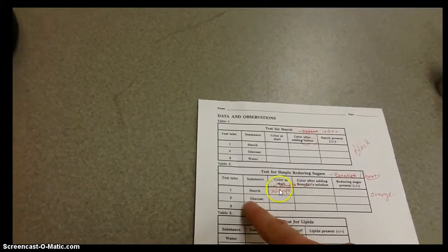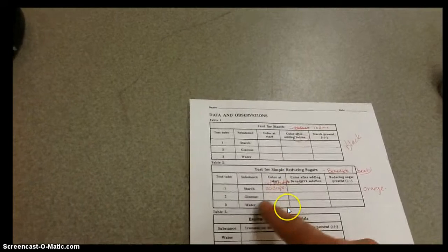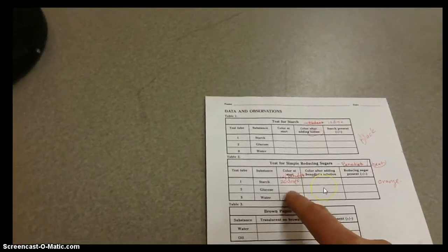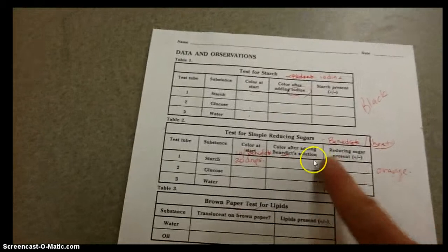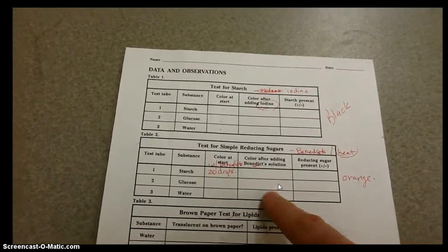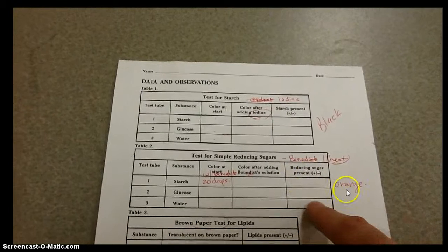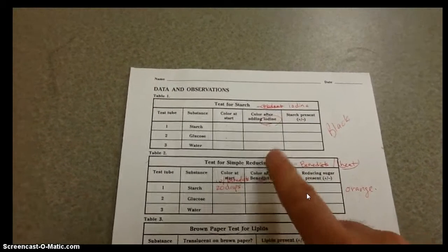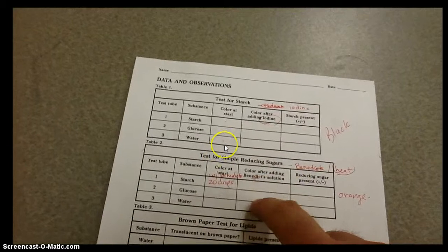Okay? After adding the Benedict solution, what color is it? Then after we heat it, that's this column. After we heat it, what does it look like? Okay? Now, you only need to heat for about 2 to 3 minutes. If it changes to an orange coloration, it is positive. If it stays blue or changes to a green, then it's negative.